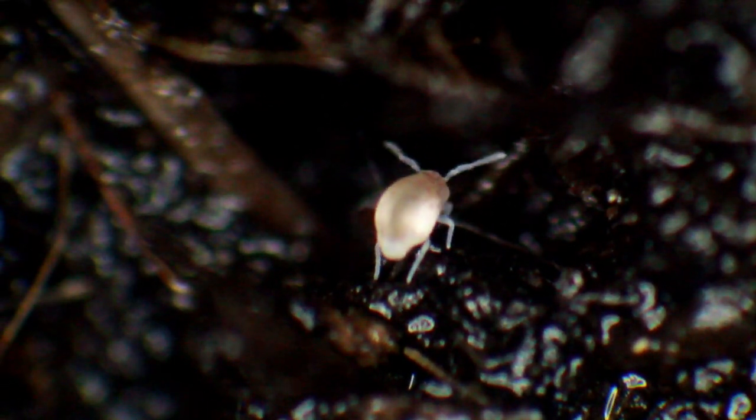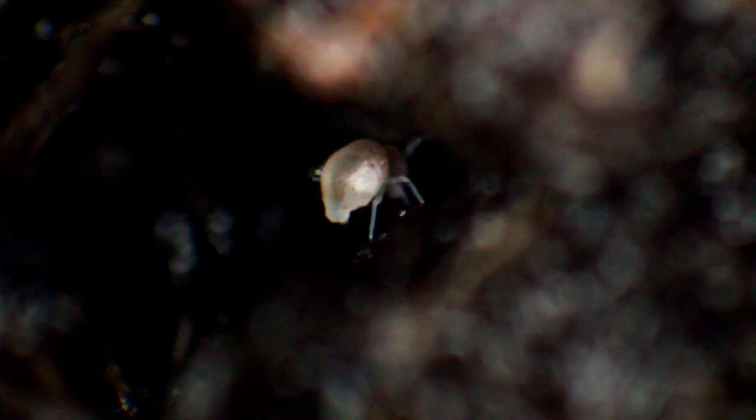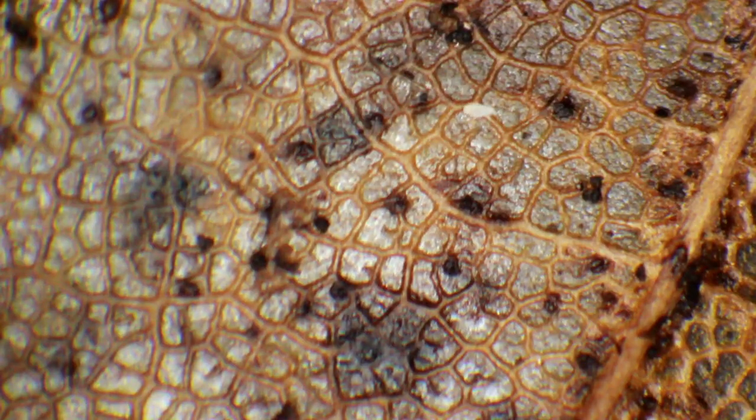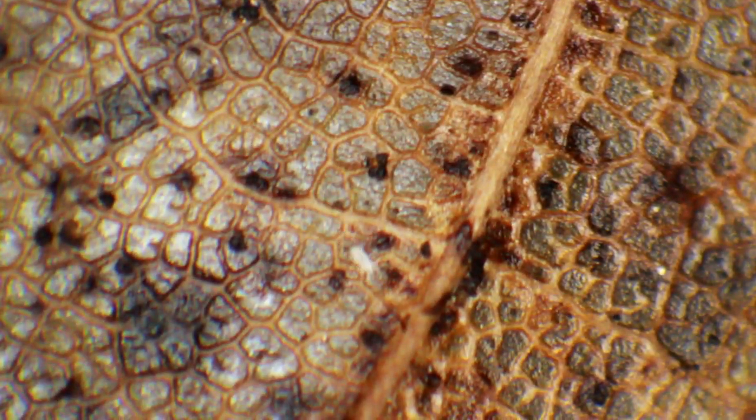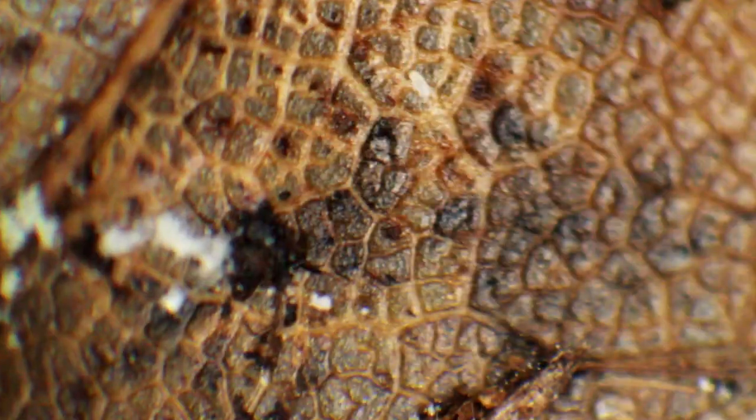I don't quite know which species these insects are — maybe some of you are entomologists with more experience. Pretty much all of them tried to crawl away from the light, so it was difficult to make microscopic observations — as soon as I turned on the light, they tried to escape and hide in the soil. Some had a problem finding the soil because they were on the leaf. This insect is running around simply looking for a place to hide, but at this spot the leaf is still reasonably intact and there is no place to crawl through. Where the leaf is already decomposed, it's much easier for the organisms to quickly crawl away and hide where there is less light.